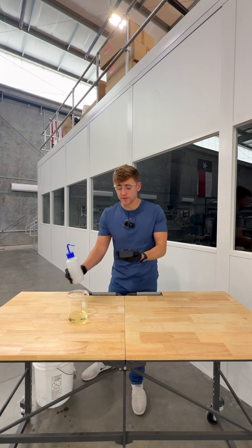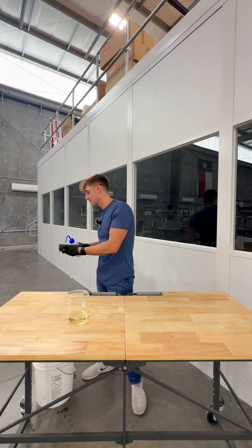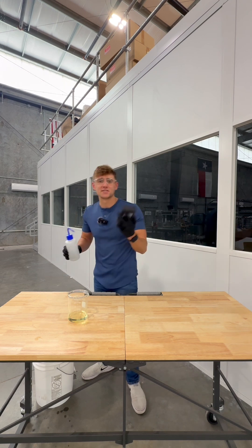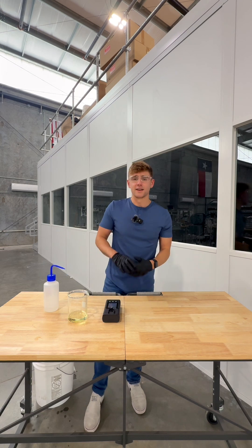When you're done testing, it's vitally important to take DI water again and rinse out that sample cell. We don't want bleach residual to stay inside the sample cell. You don't want to dry anything up, crack anything, ruin anything, so make sure to rinse it with DI water or tap water just to make sure that the handheld is safe.